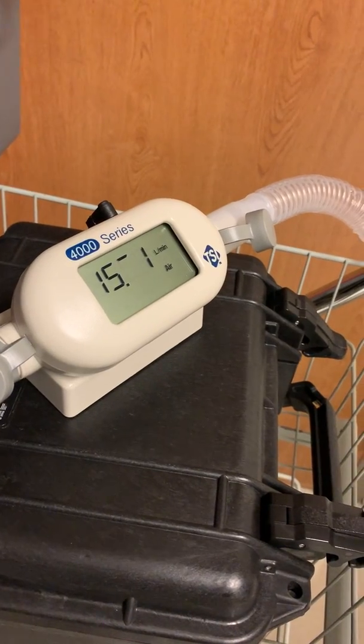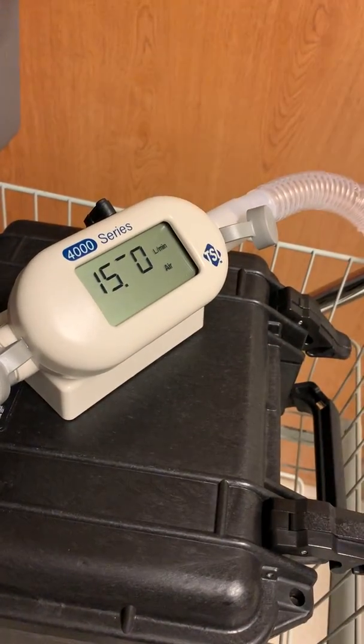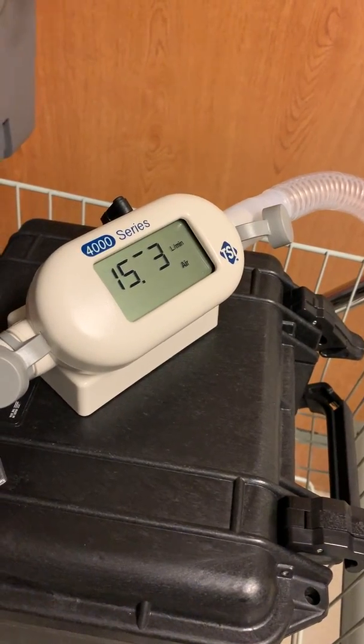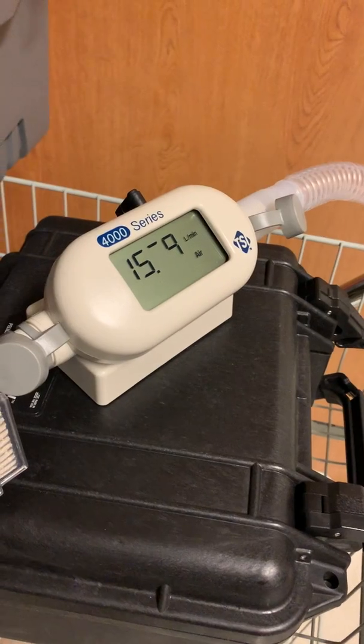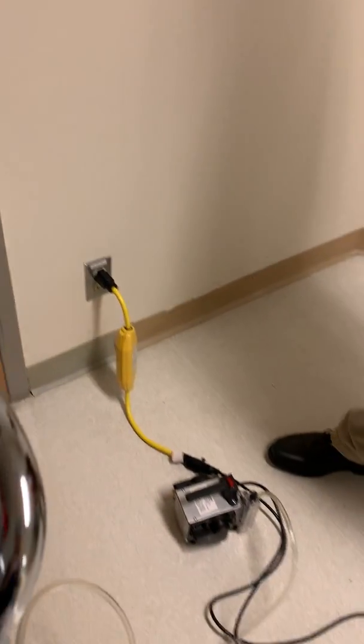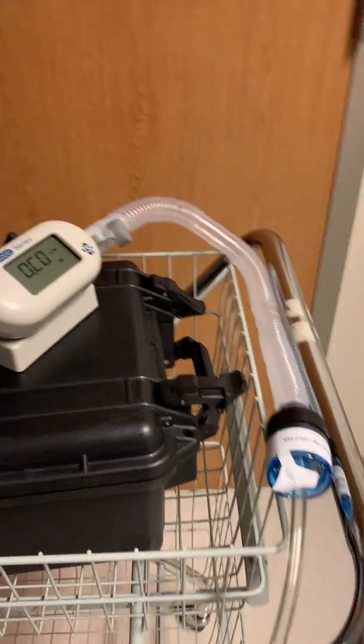As you can see, we're verifying that the flow rate is at least 15. I usually let it run for a few seconds just to ensure that it doesn't go below 15, and then I turn it off. And that's all there is to it — you just calibrated your aerosol pump. Nice job.